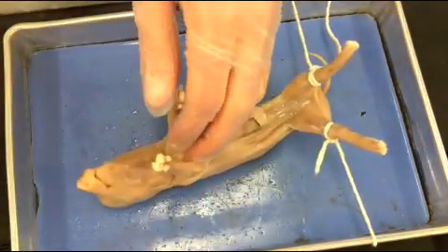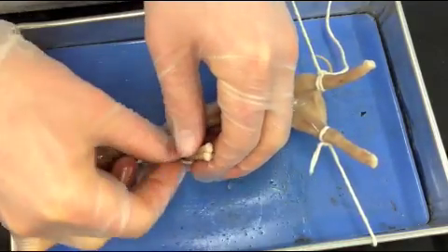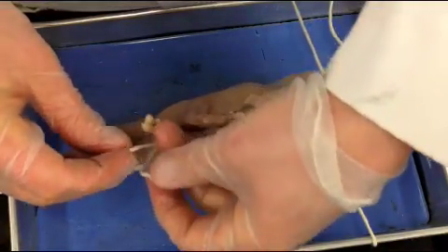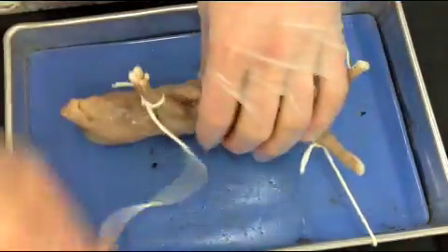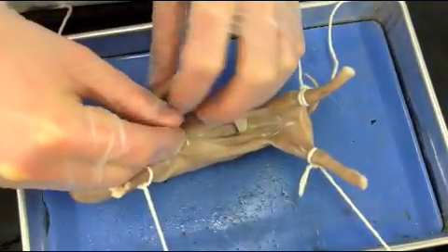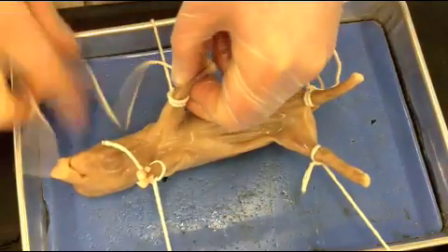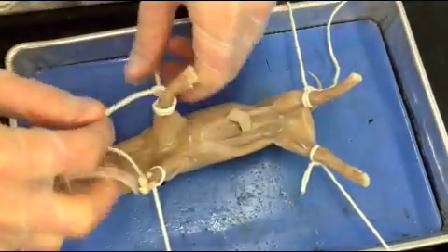Now we're going to move to the front portion and do the same exact thing — tie it around the front leg. I just like to double knot it to make sure the string doesn't slip off. We'll bring that underneath again. If you tie it tight enough, the pig should just sort of sit on its back without much trouble.